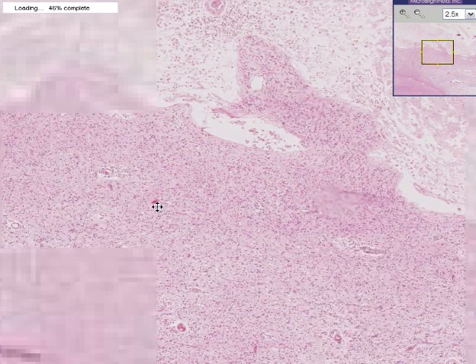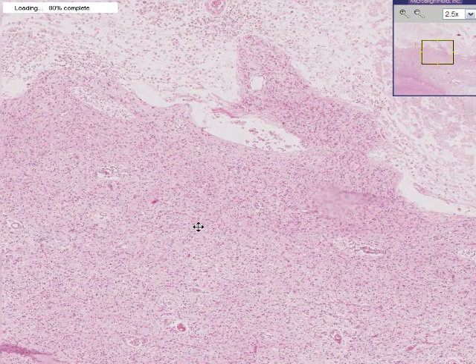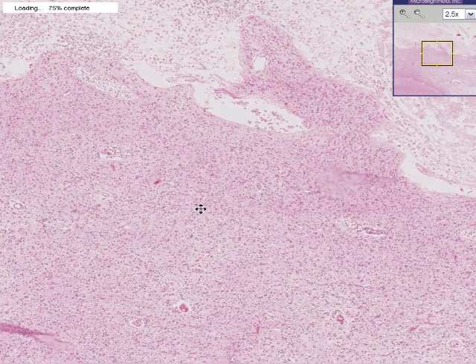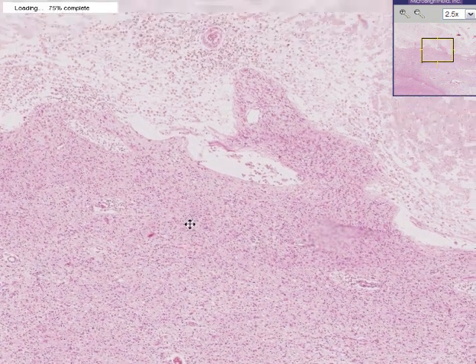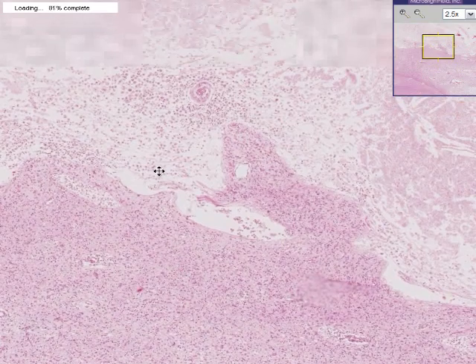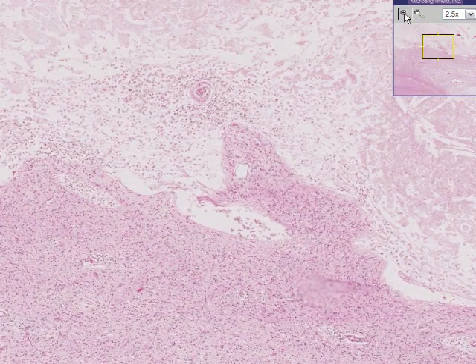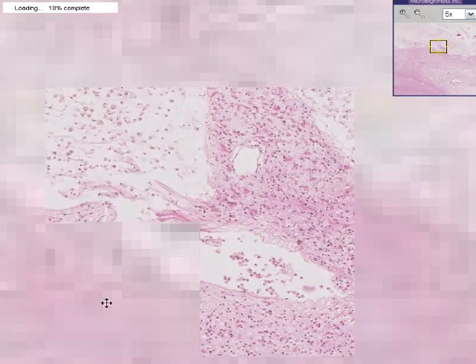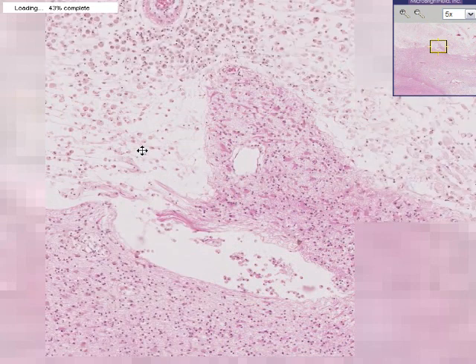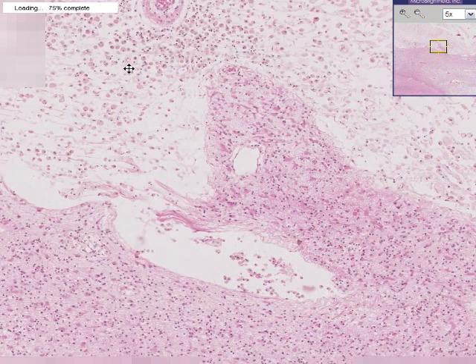You may or may not recognize the lower field as representing brain tissue, and you may or may not recognize the fact that the upper part of the field is inflammatory tissue.